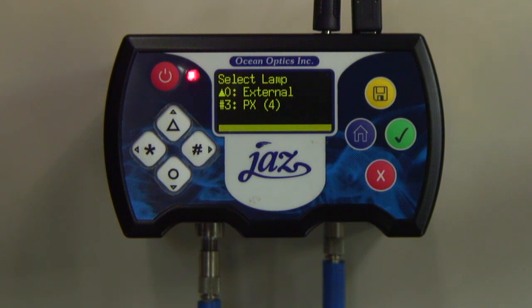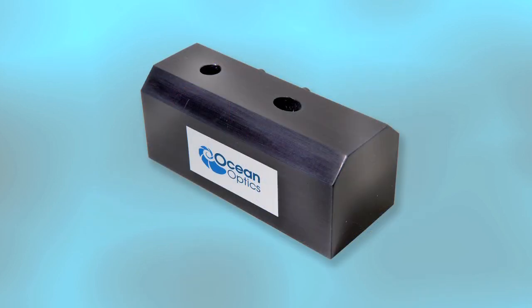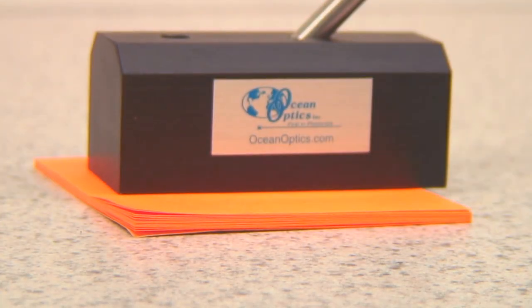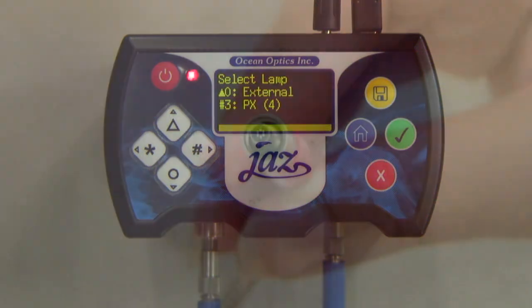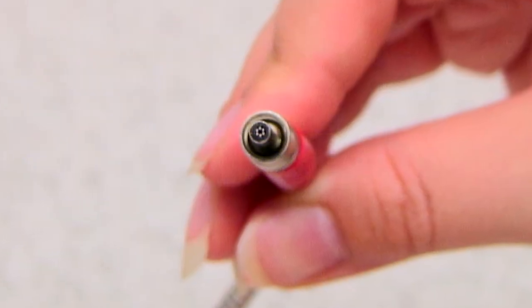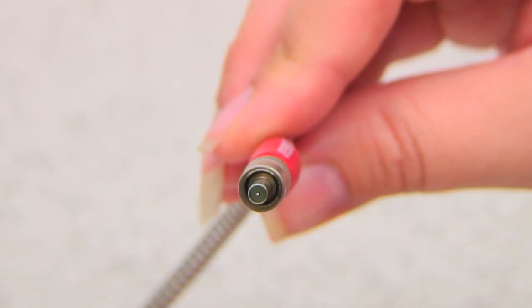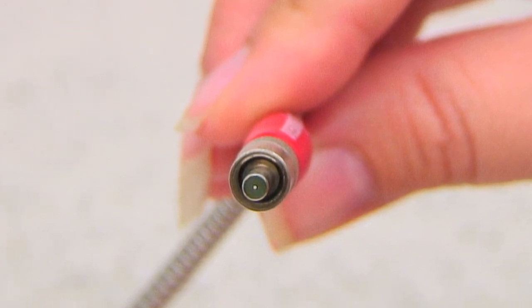To perform a basic reflectance measurement, you will need the QR4000-7 VisNIR Reflection Probe, an RPH1 Reflection Probe Holder, a WS1 White Reflection Standard, and a sample to measure. In this demonstration, we'll be measuring an orange piece of notepaper. Making proper connections to the reflection probe is critical. The SMA905 connector with six illumination fibers should be connected to the PX module. The SMA905 connector with a single-read fiber should be connected to the Jazz Spectrometer module.